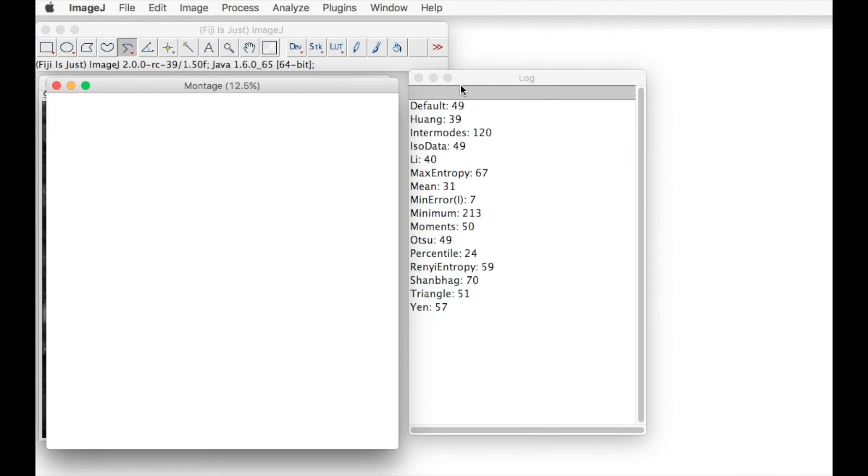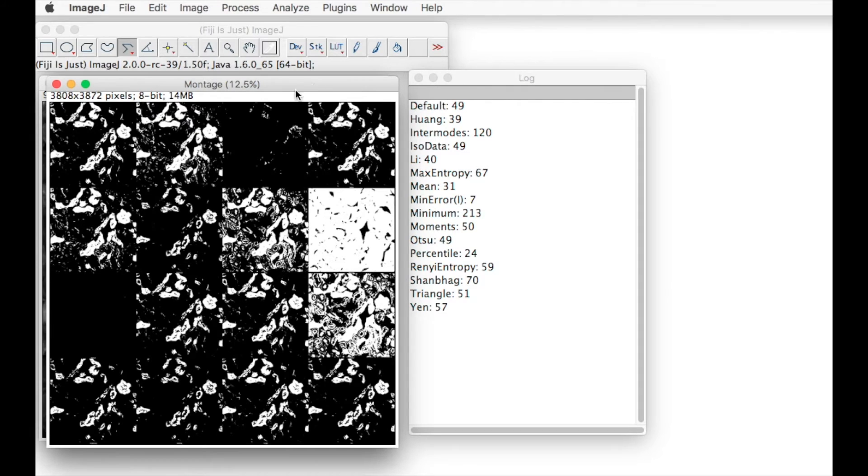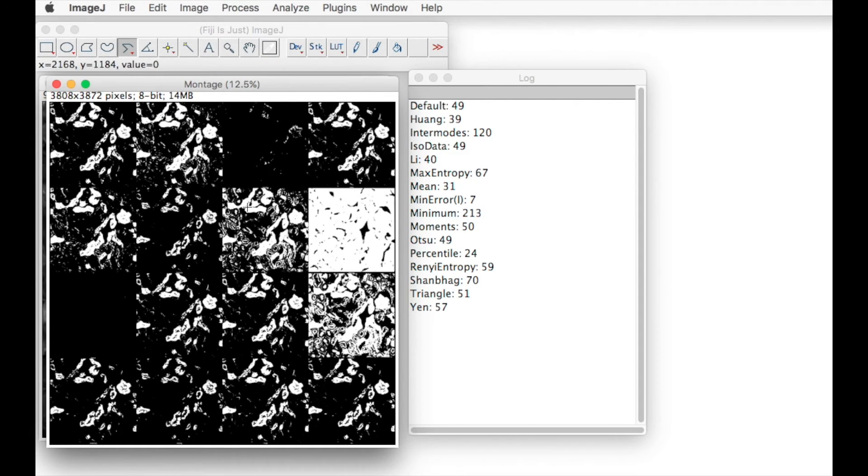You can minimize this by pressing the minus button and it shows us an example of each of the different types of thresholds set.